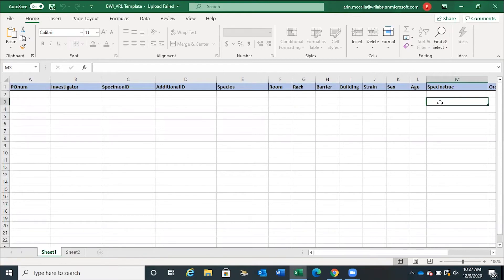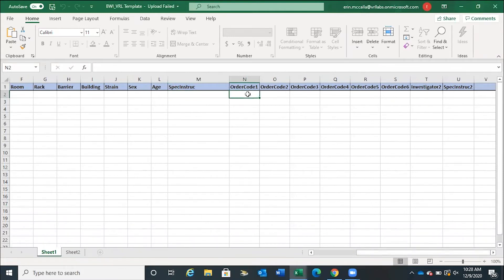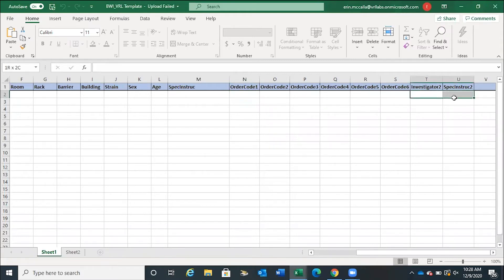The Special Instructions field may be used at the client's discretion to capture any additional information needed for your order. However, only the first row captures the data that you will see in the PDF that is generated. The maximum allowable data length in this field is 550 characters. One order code is required to submit samples to VRL; however, you can use up to six different order codes for a single sample. If you require more than six order codes, please contact us. If you would like to include an investigator or special instructions tied to a specific sample, you would put them in Investigator 2 and Special Instructions 2. These two fields have no maximum data restrictions.